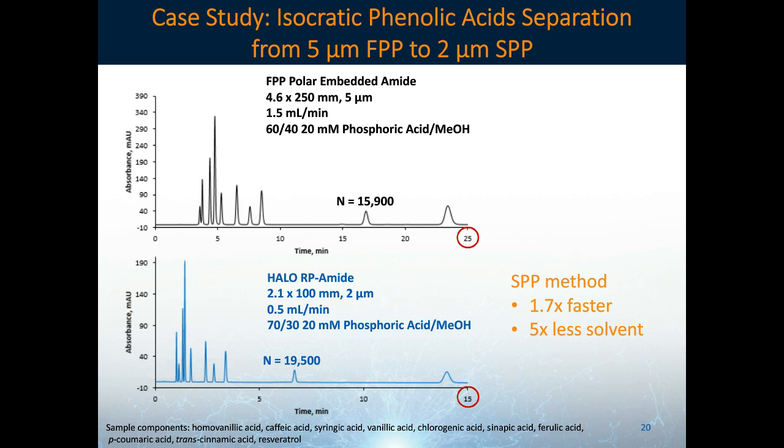So you might be thinking, oh, well, it didn't really go that much faster. It's not even 2 times faster, but look how much solvent you're saving. That's 5 times less solvent. That can really add up if you're running this assay multiple times.